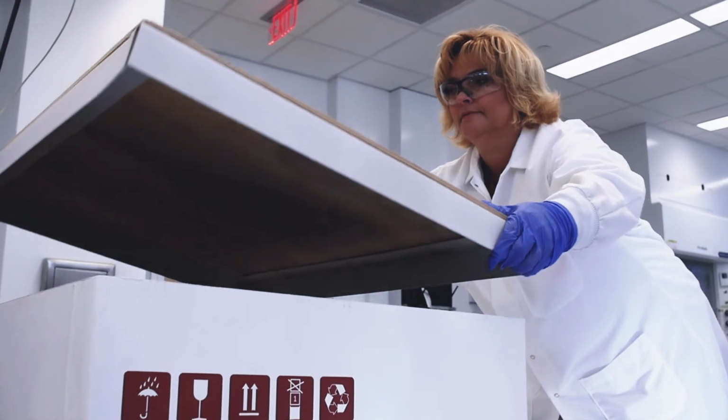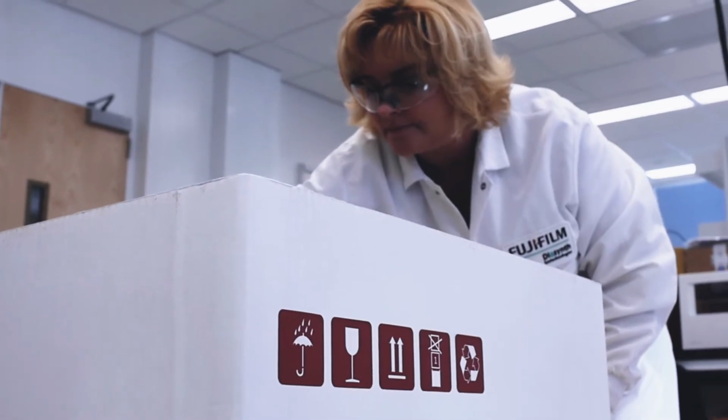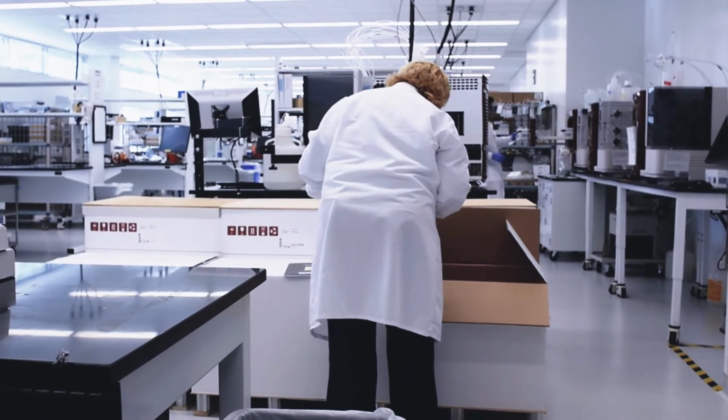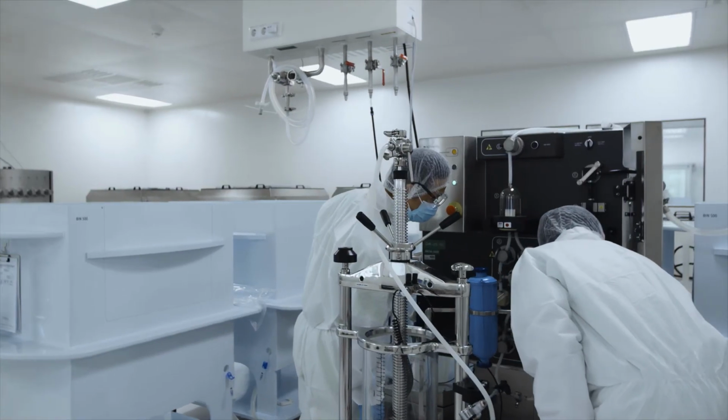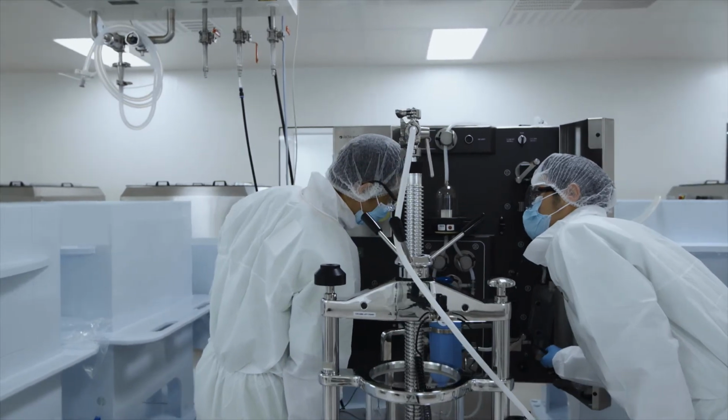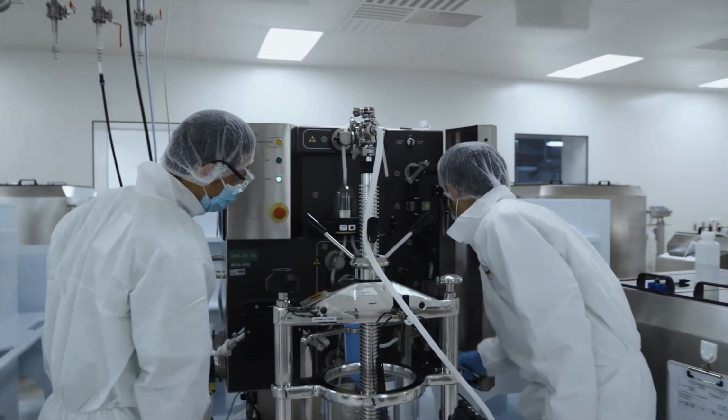The family approach is the way to duplicate your production lines, but you only have to validate the first production line and don't have to repeat that validation work on additional identical production lines. We can exploit this family approach in single-use manufacturing facilities because the bag in the bioreactor is the same bag in additional production lines that we add to increase capacity. In this way, we can reduce the amount of work to validate additional capacity as we expand our facility.